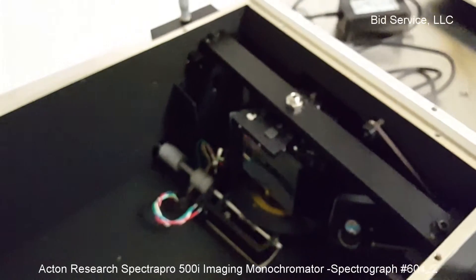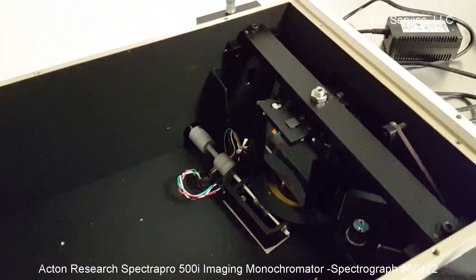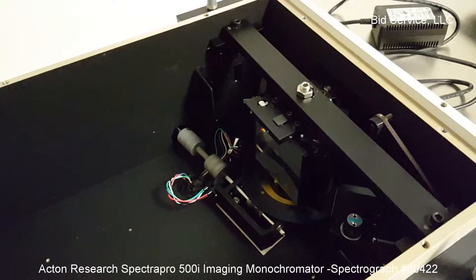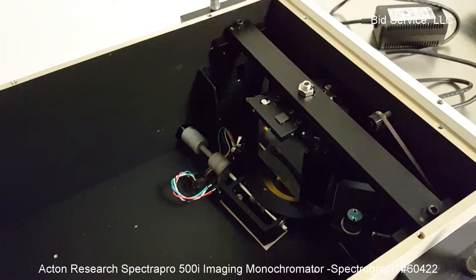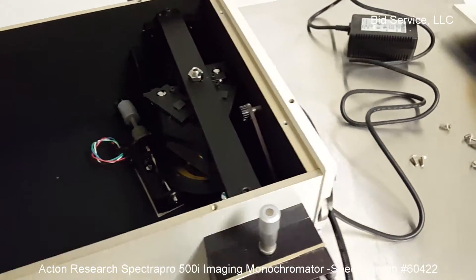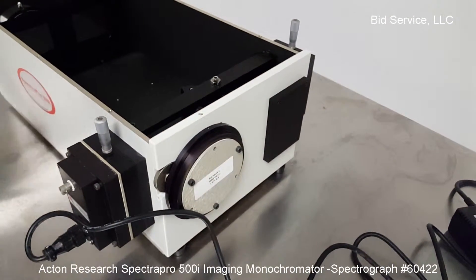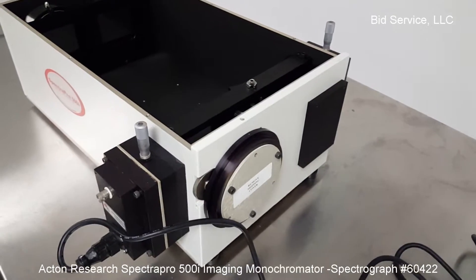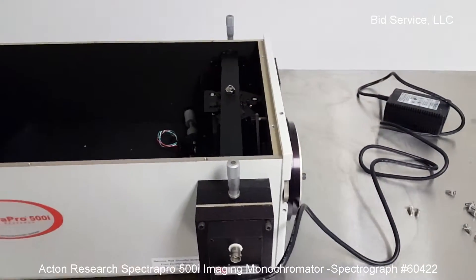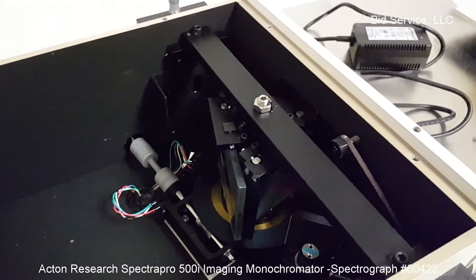Once I power it on, the grating will start initializing. This system can be connected to a computer for driving and controlling the system for wavelength scan. At this moment, the system is not included with a PC or any software associated with it. This is demonstrating how the gratings are getting initialized.